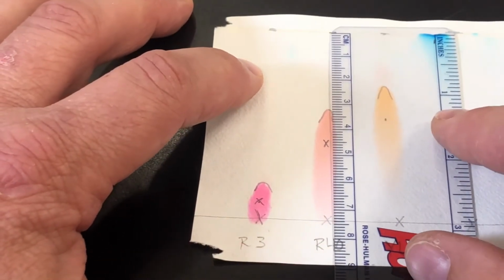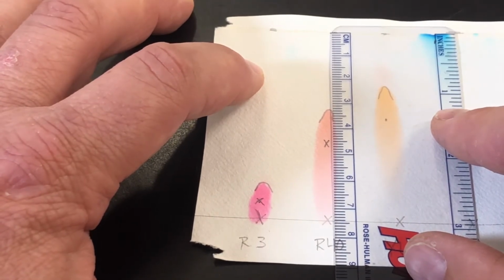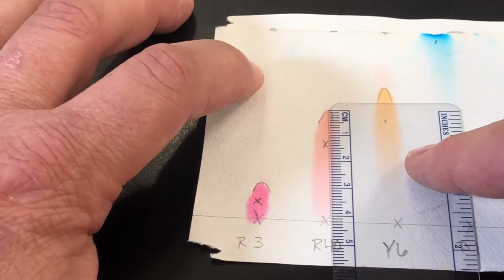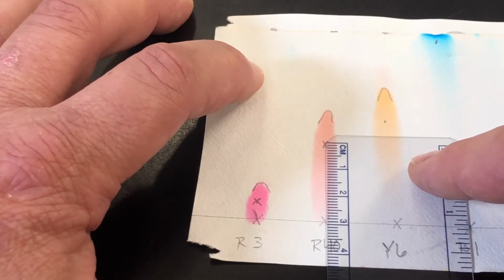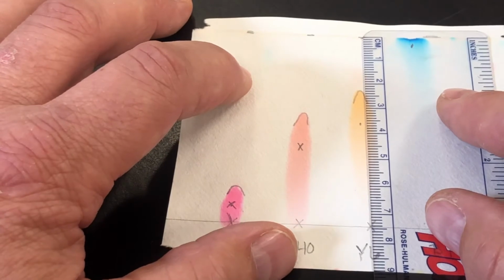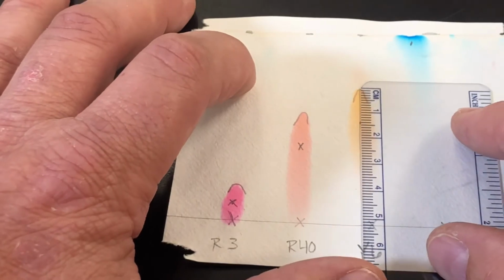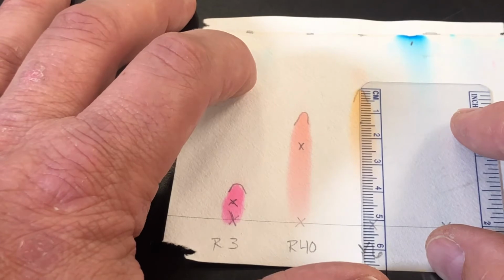Again, this is for the solvent. This is 7.41 maybe. The tip for the red 40 is 4.20. Center mass is 2.90. For the yellow 6, I have the furthest it went, 7.42. I have the tip is 5.20.